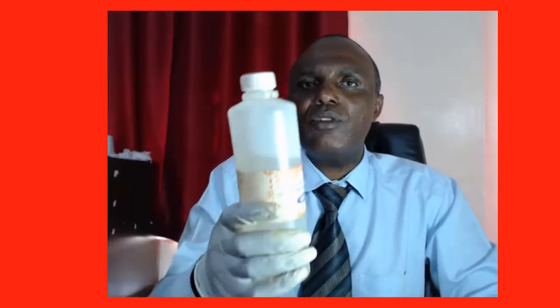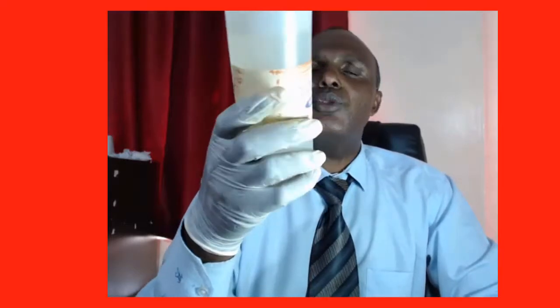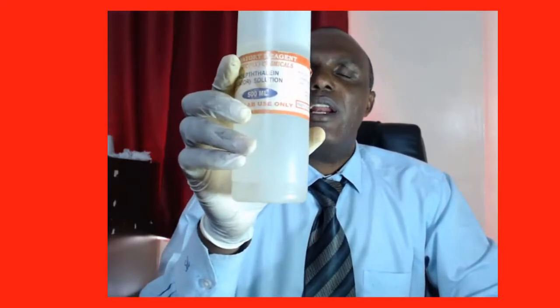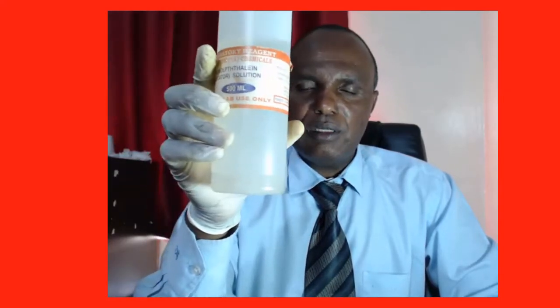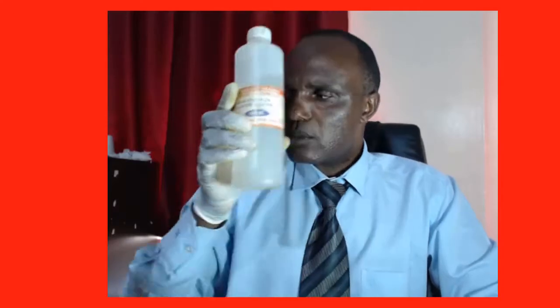Now, the other type of titration that we are going to do in the future is redox titration. Redox titration does not require an indicator. For example, in this titration between oxalic acid and sodium hydroxide, we are going to use a phenolphthalein indicator, and we will know when the reaction between the two substances comes to an end.